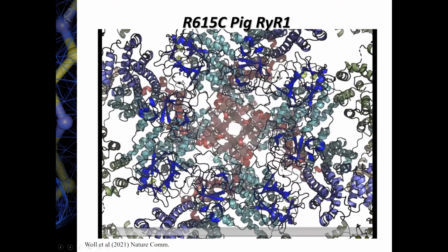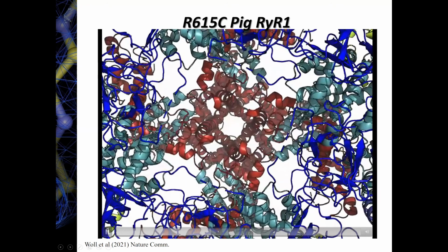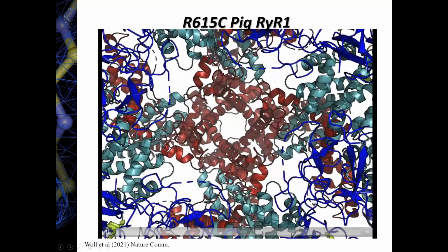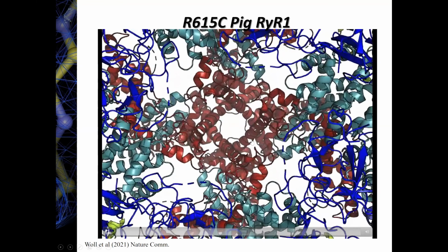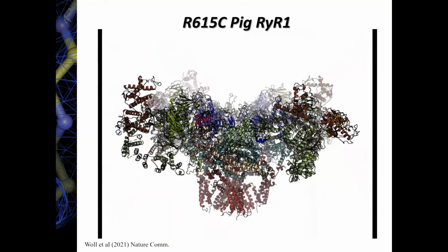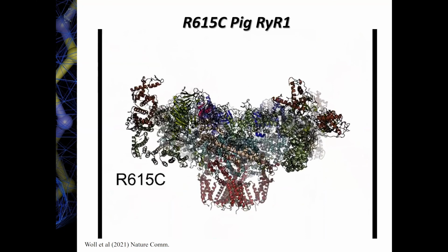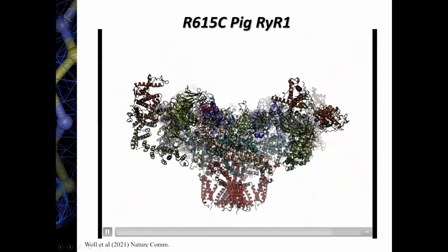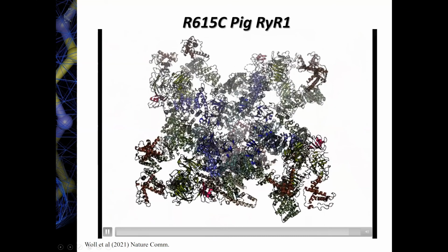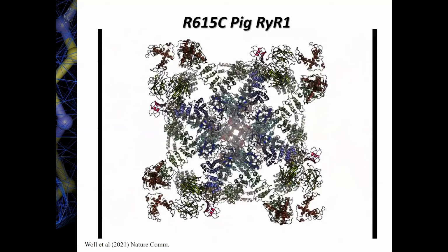And actually, if we zoom in here to the transmembrane region, you see that the pore forming region, which is shown in red, is actually getting wider. And in fact, the disease mutant is in an open state. So the mutation under these conditions used triggers opening of the Ryanodine receptor. And here's shown a side view where you can also see substantial conformational changes. Okay, so here we have a disease mutant that clearly affects the structure of the Ryanodine receptor, and under these conditions actually triggers an open state.